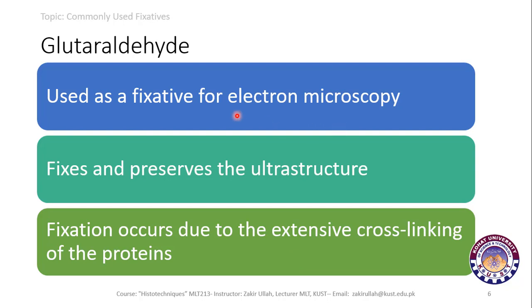The second fixative is glutaraldehyde, that is used as a fixative especially for the electron microscopy of the tissue, and glutaraldehyde fixes and preserves well the ultrastructure of the tissues.